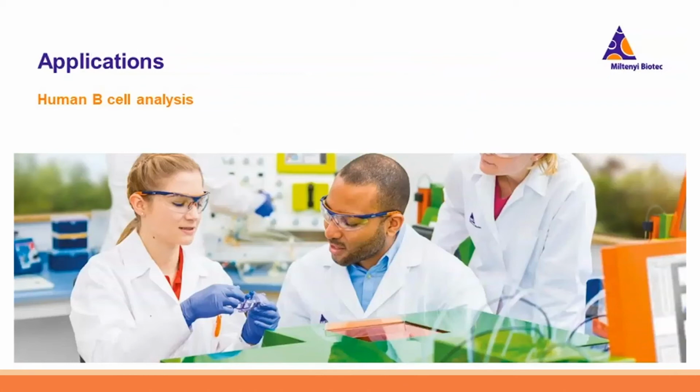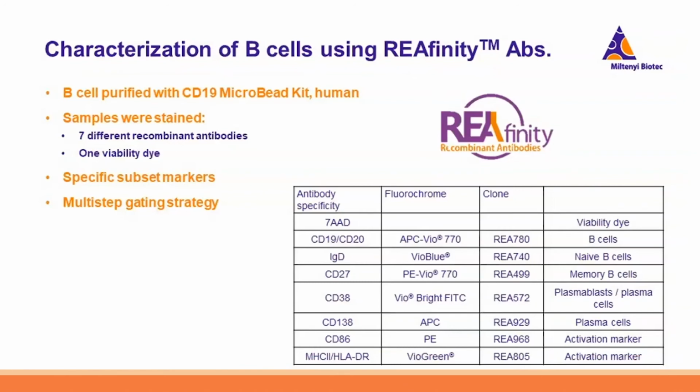And now we will go into the application section. I am going to show you some examples, first for human B-cell analysis. Here I have one of the panels that our R&D is regularly using.